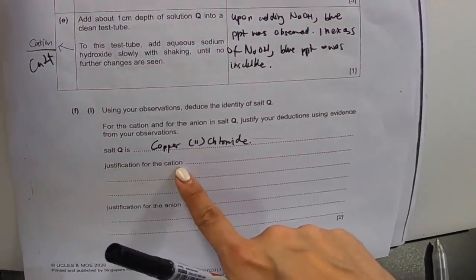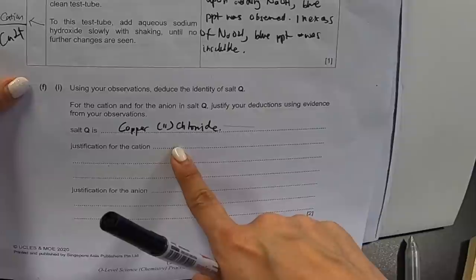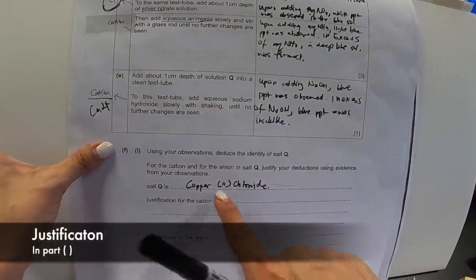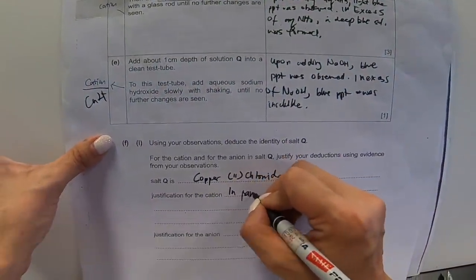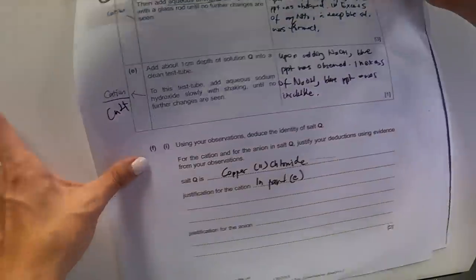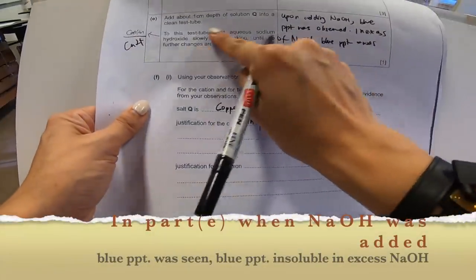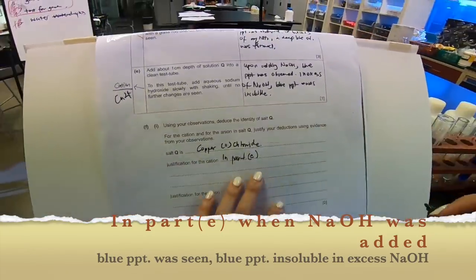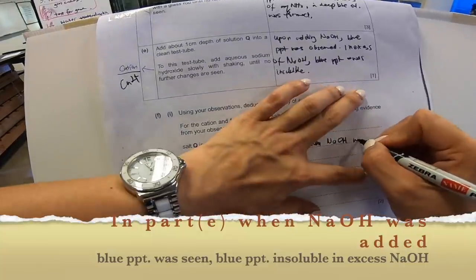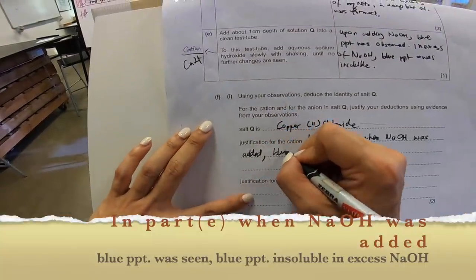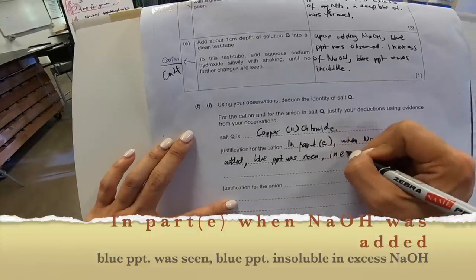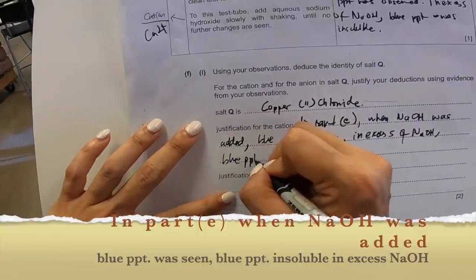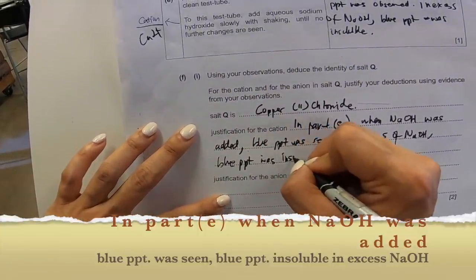Justification for the cation. In order for us to justify the cation, let's remember that justification require you to tell me the parts. So start with in part E. What do you do? Because when NaOH is added, a blue PPT was observed. So I'm going to write it down. Let me fold the paper so that I can write down. And in excess, the blue PPT was insoluble.